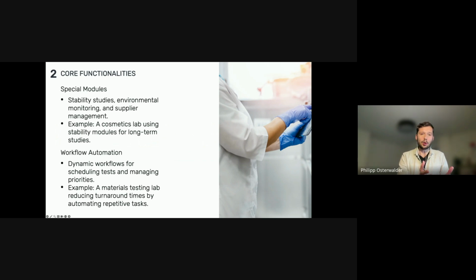This can be, I call them donkey work, copy and pasting, or just generating a report, or just sending a comment or a hint or an analysis result to the responsible person within a couple of clicks, instead of opening up an email, typing a text, and copy and pasting the screenshot. So there can be some functions which are crucial within the LIMS and are also crucial to use it for the digitalization in a laboratory.